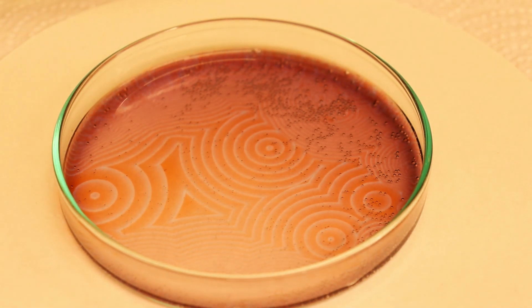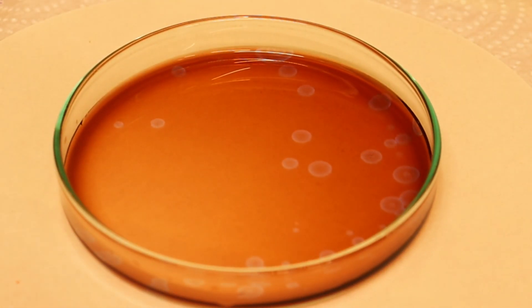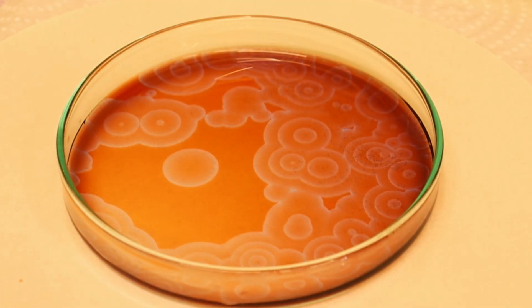That is why the blue circles keep on forming. A very unique thing is that the blue circles are just a paper-thin layer on the red solution surface and it looks as if they were made from a solid compound. Nevertheless, the reaction was a complete success.